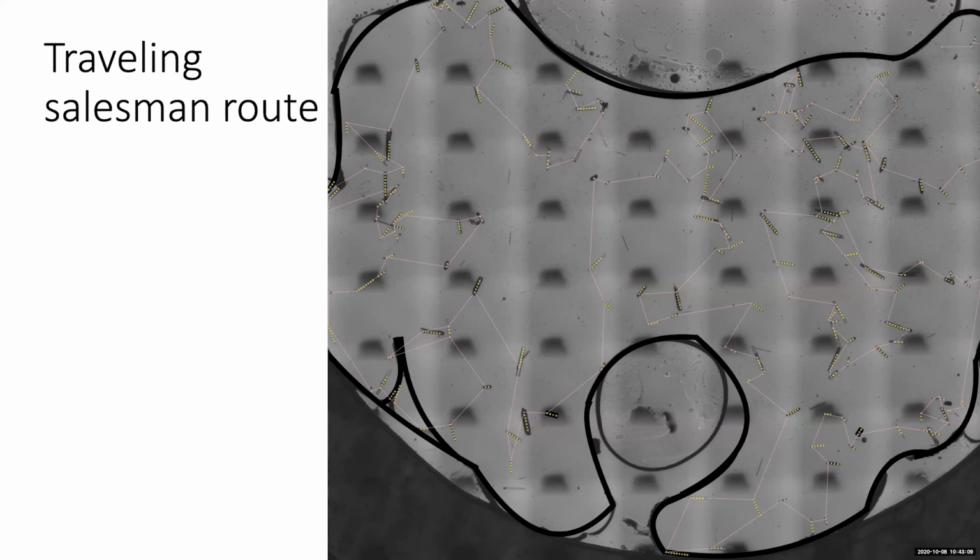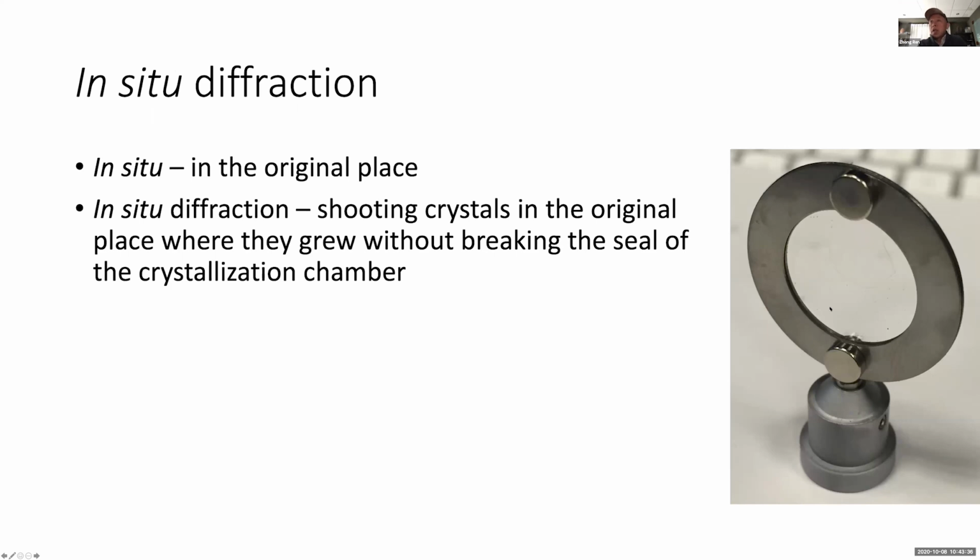Any other questions? Yes, I have a question. Do you have a picture of how the vapor diffusion takes place when growing the crystal in your device? A good question. Sorry, I did not mention this. If you crystallize protein crystal on this kind of device, it's entirely closed. There's no vapor diffusion occurring. This is a batch method. Okay, this is just a batch method.